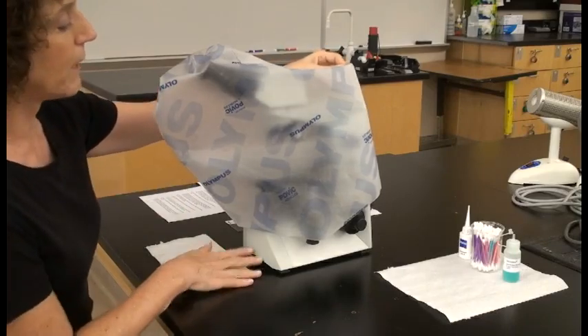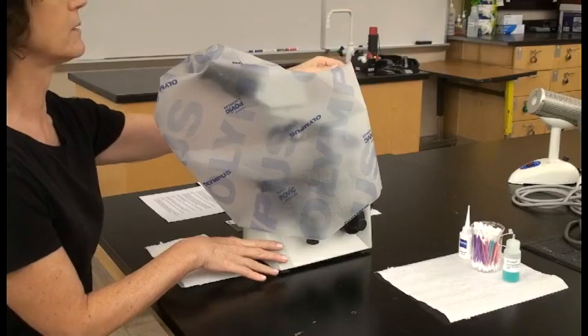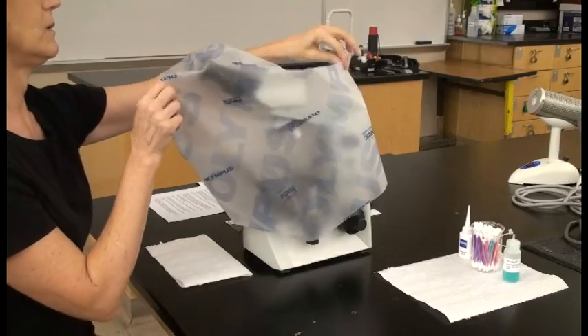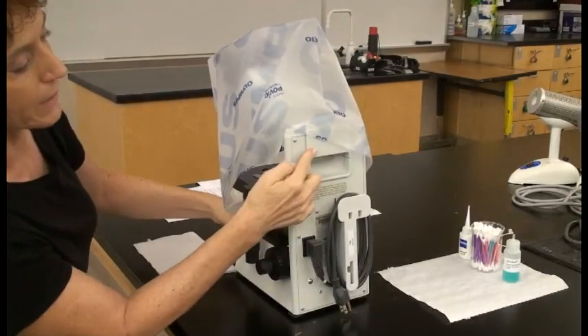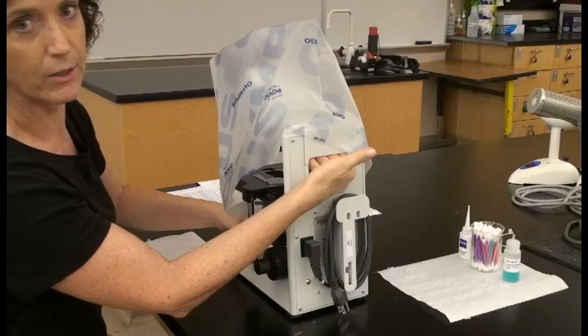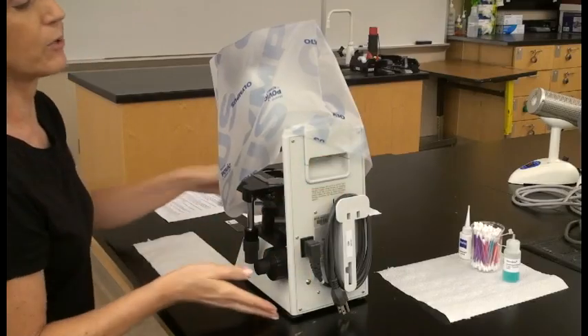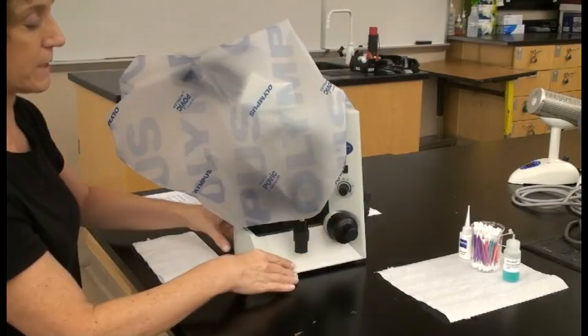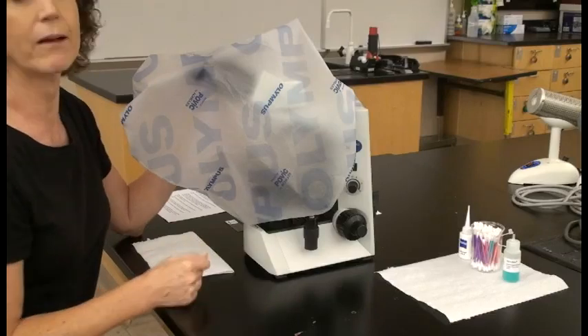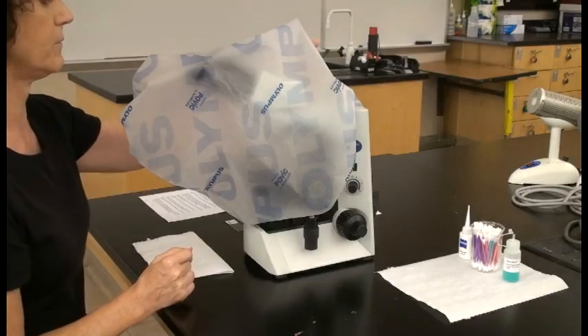When you come to your microscope it should be on the desk. If not, you're going to put your hand on the back where there's a carrier, and your other hand on the base, and carry it that way to make it more stable. But most of the time we'll have our microscopes already on the desk.